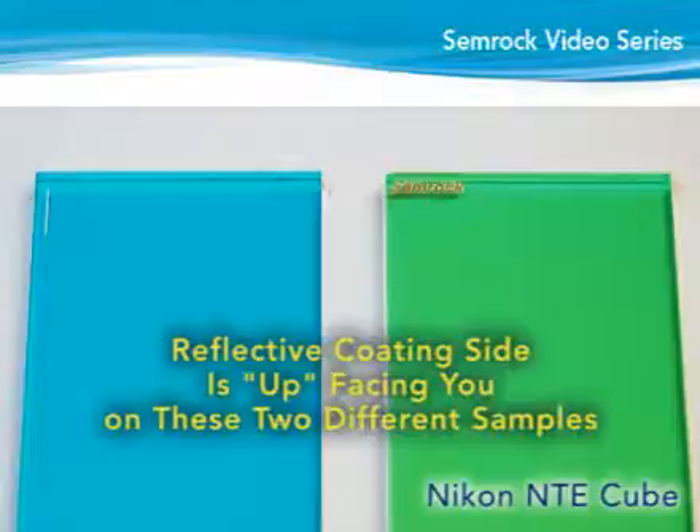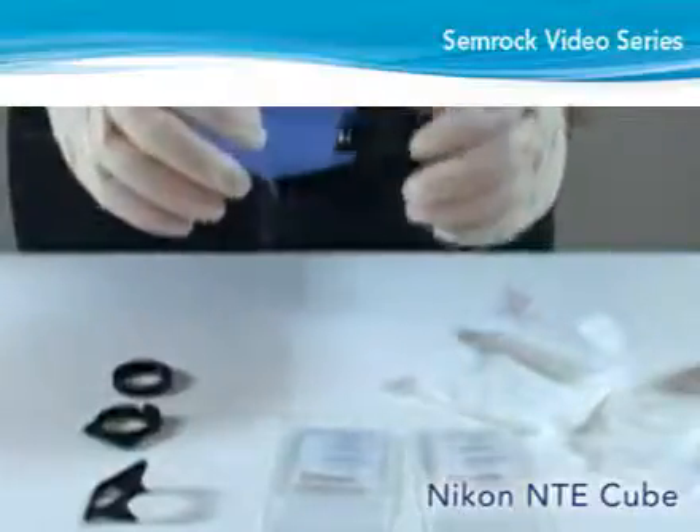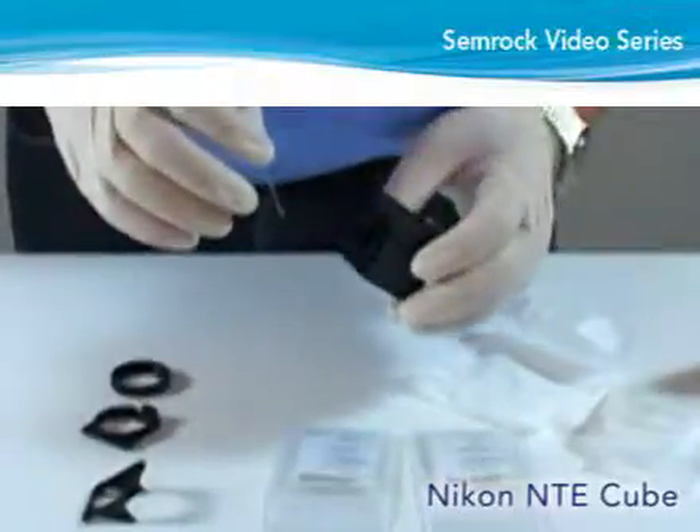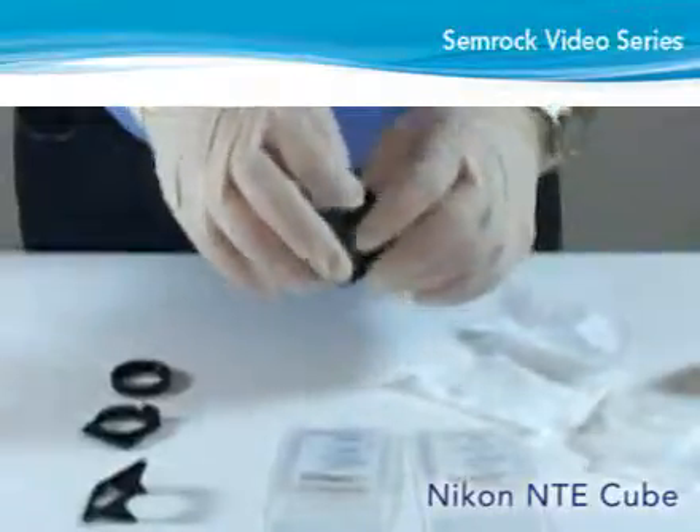the reflective or coated side is up. If the edge appears white or uncolored, the uncoated or anti-reflective side is up. Place the dichroic inside the cube onto the slanted surface with the reflective, coated side facing down.